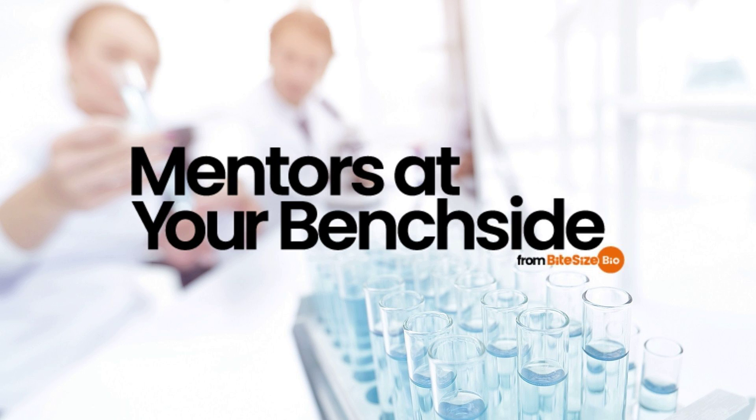So recording an OD value in your lab book doesn't really mean anything, as this number is as much dependent on your spec as on the density of your culture. What you really want to know from an OD600 reading is the density of the cells, for example in cells per milliliter. And to get this, you need a standard curve. In other words, like any other spec-based experiment you will ever perform, you need to calibrate the absorbance value against the number you actually want to know.